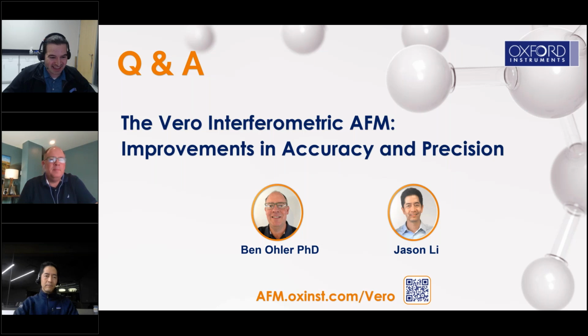Great, thanks. So the second part, they ask, is there possibility to measure pyroelectric coefficient too? We haven't done any specific work on that. I know that there are some examples in the literature, people studying pyroelectric materials with AFM, but we haven't done any sort of development of new techniques for that on Vero.